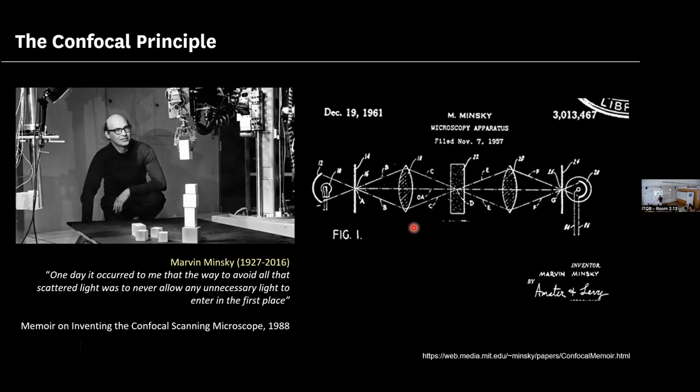This physical obstruction is similar to something those of you who have glasses and sometimes cannot read the captions on the TV do: you tend to squint your eyes. It's not confocal microscopy, but what you are doing is narrowing into a small slit, filtering so that you only allow the rays of light that come perpendicular to your eyes to reach the retina. Those are less deviated than the ones that come at higher angles. So you can see a little bit better for a few seconds, until your muscles cannot hold that position. But this physical separation of light, depending on where it comes from, also works in a confocal microscope.